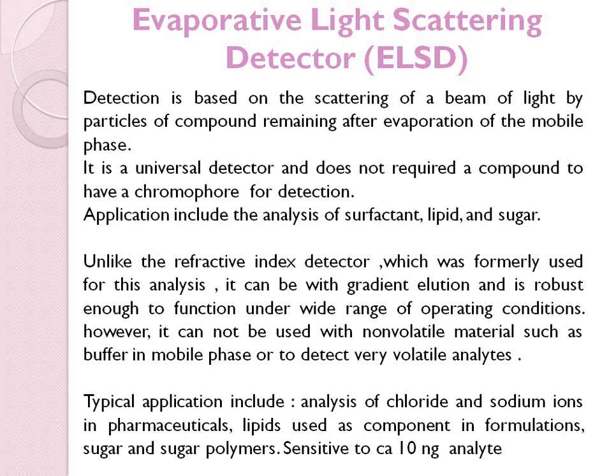This detection is based on scattering of a beam of light by particles of compound remaining after evaporation of the mobile phase. It is a universal detector and does not require a compound to have a chromophore for detection, such as surfactant, lipid and sugar.